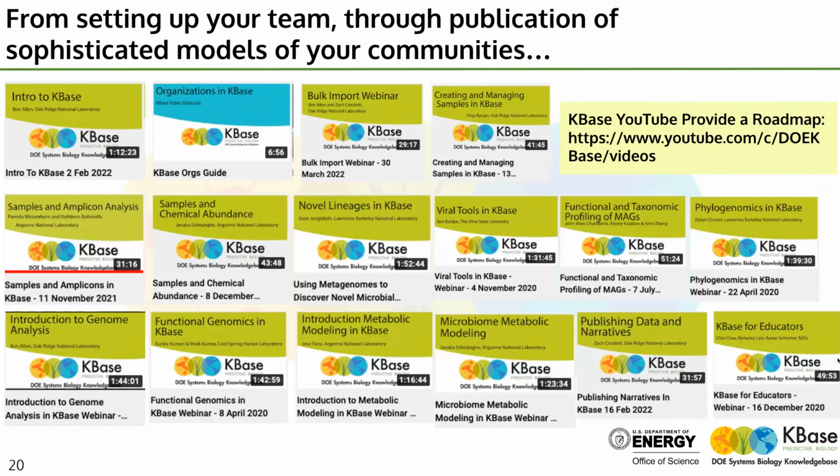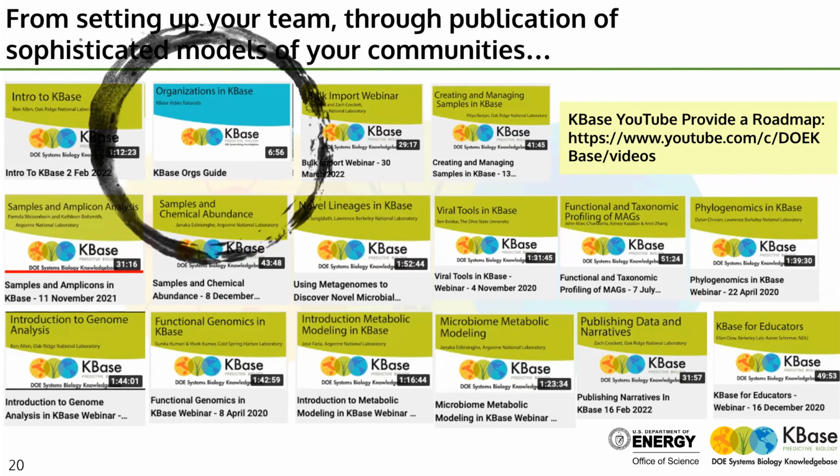Once you have it, it can also be used by educators. And Ellen, Dow and Alicia have done a spectacular job building a fantastic team of people creating educational materials based on these types of analyses we do here. As we move through, I'll show you what we're using along the way. So let's start with organizations in KBase.